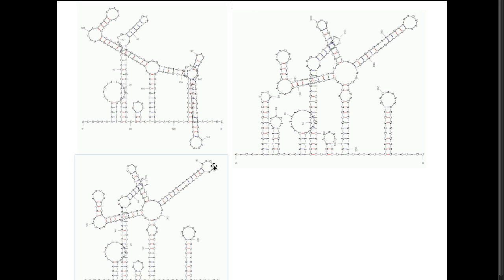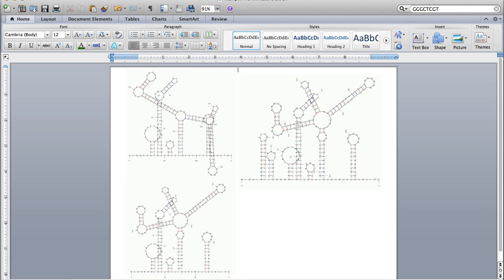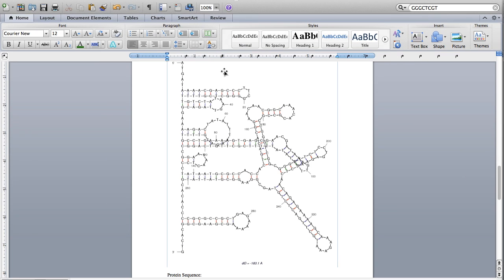But like I said, don't freak out. Just pick the best one. Just give it your best shot. That's all we can ask for. So, hopefully that puts you a little bit at ease for this step. We usually get the most questions on this.